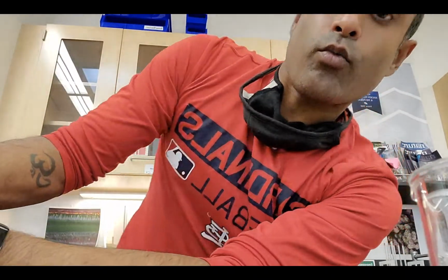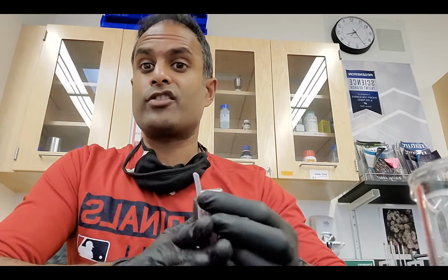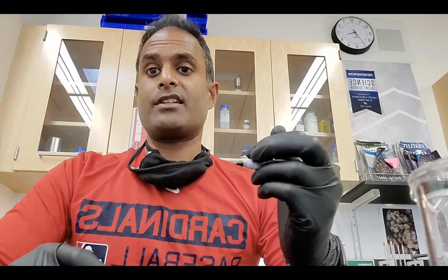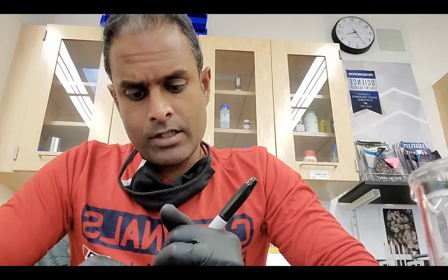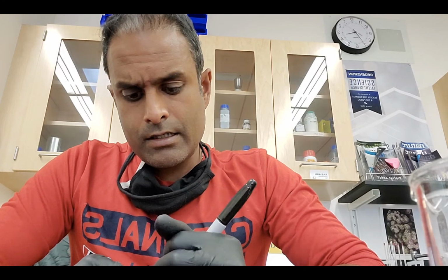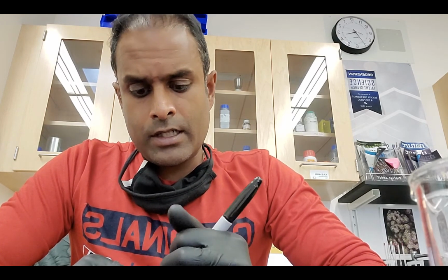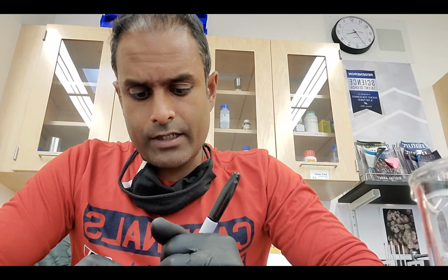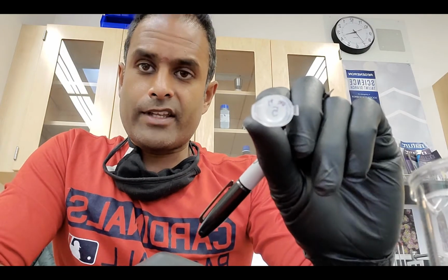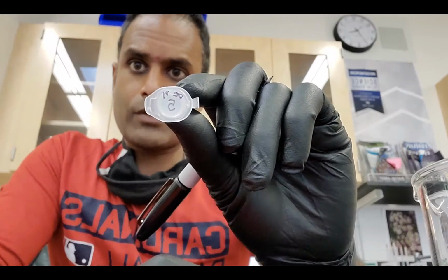All right, so why am I doing this stuff? Well, everything that I'm actually doing right now is not dangerous to me, but it can be dangerous to other people. So I want to make sure that I'm closing tubes as much as possible. So now that I have my tube, I'm going to go ahead and take a Sharpie and label my tube. I'm going to label it D period 1. And then I'm going to put a big 5 on it, because when I asked, somebody told me that I was going to be sample number 5.